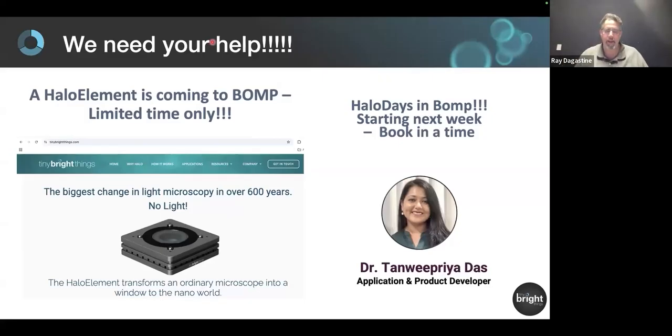We'll have a collection of the petri dishes we like if you want to try those out. If you do come with your own petri dish, flat glass one, no ridges on it. But yeah, we really actually want you guys to come try things. If you get a picture that's useful, great. And we want to hear your impressions. So with that, thanks so much, and we'd be happy to take any questions.